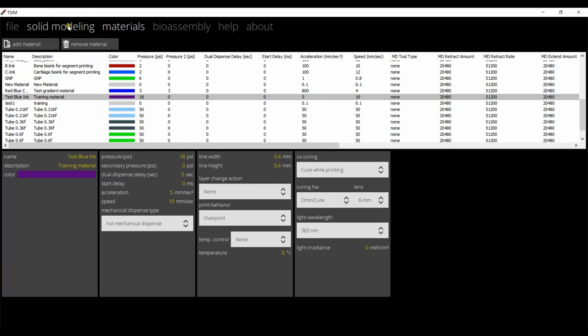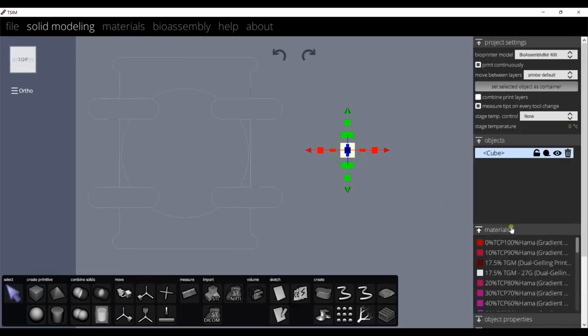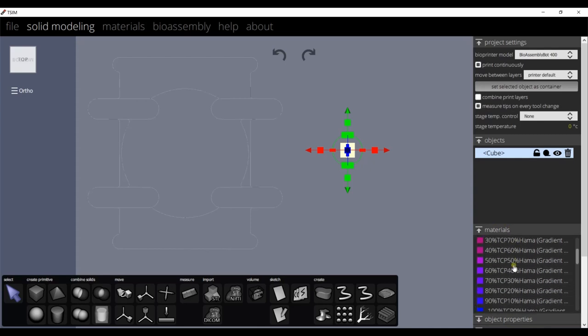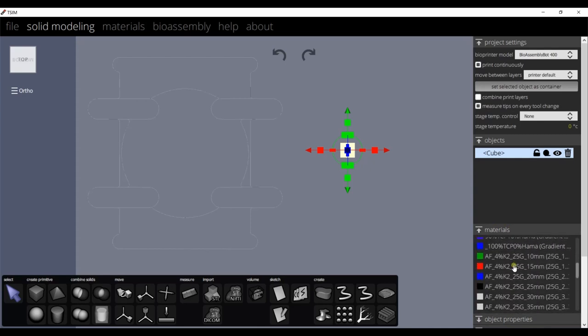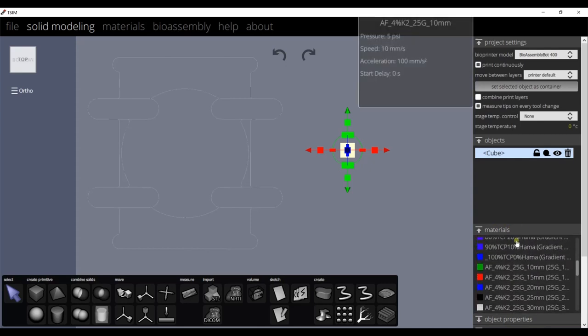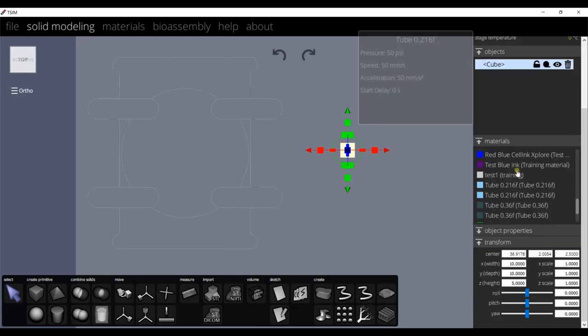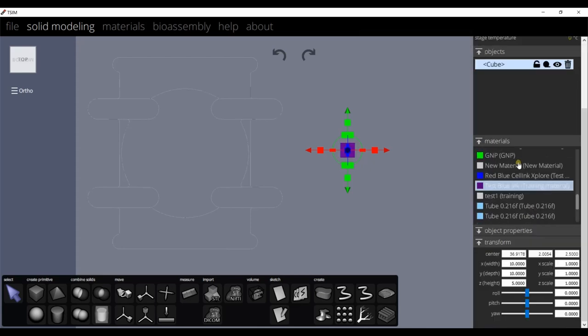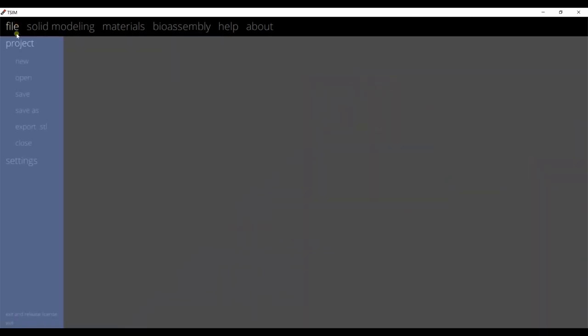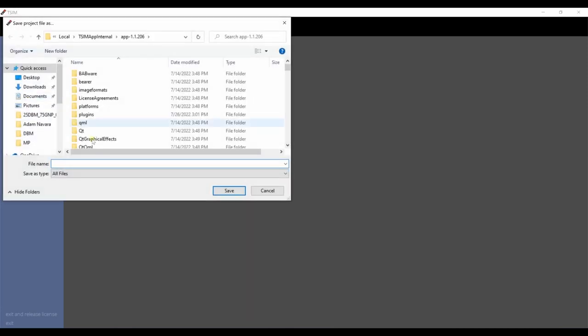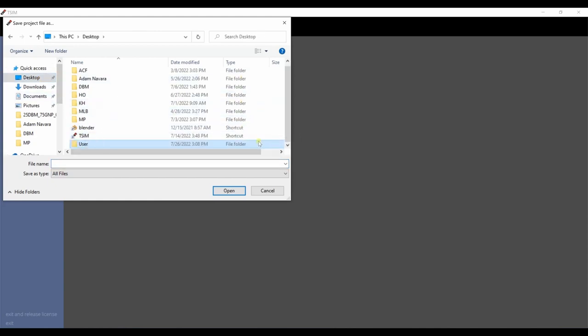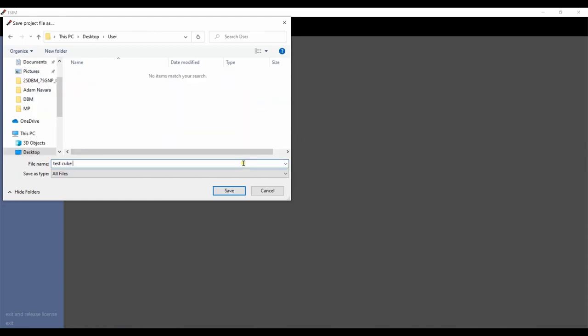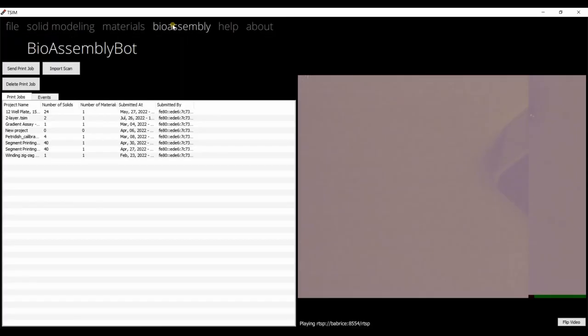Now go back to the solid modeling menu. Click on the materials. After selecting the object, scroll down to the materials and select the material we have created. To save the file, click on File menu and click Save to save the file as a TSIM file. Create a new folder for the user and save it.